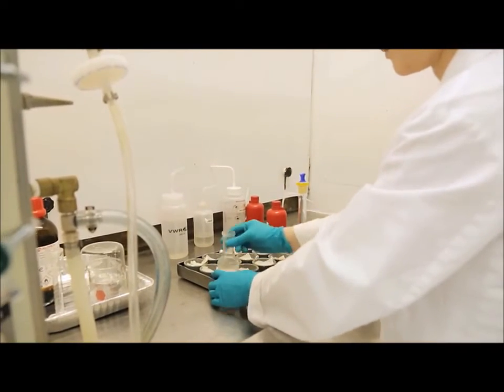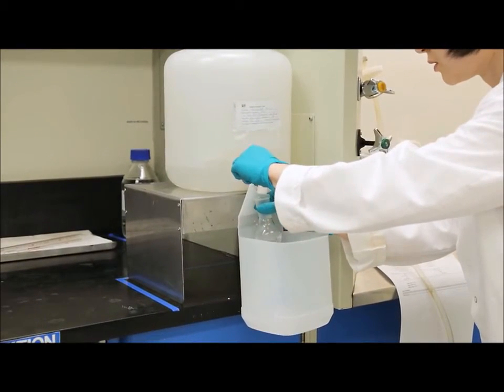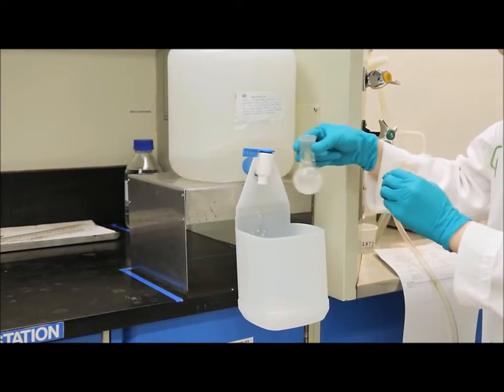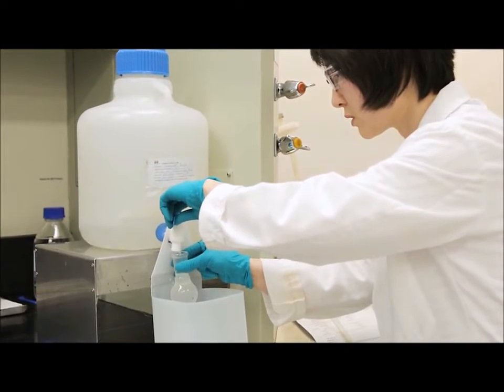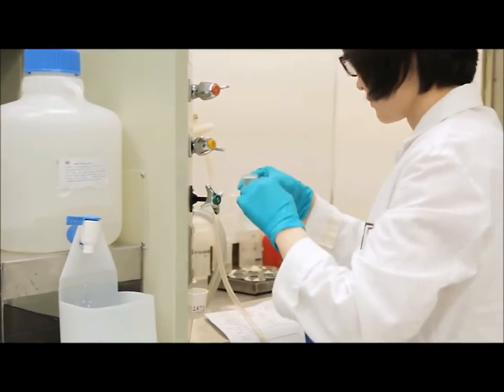Now that the internal standard has been added, next we're going to add our saturated sodium chloride solution. To begin, we fill the flask approximately half full and we make sure to swirl the sample well. Once we have swirled the sample well, we can continue to add the saturated sodium chloride solution until it is almost full.